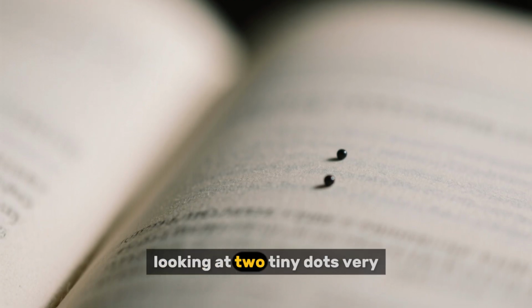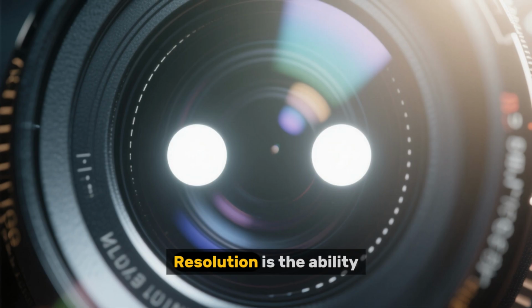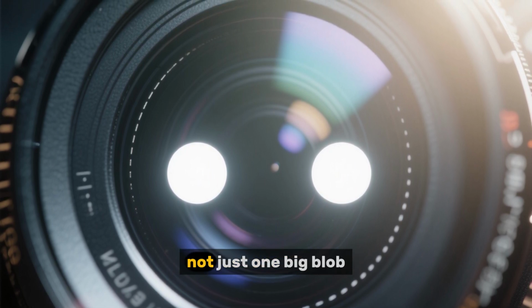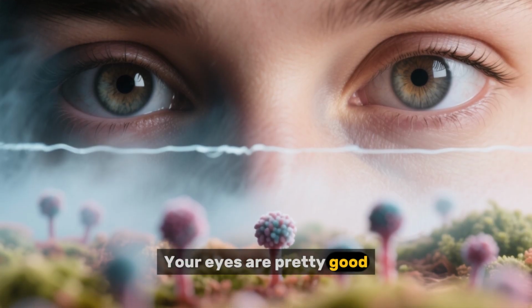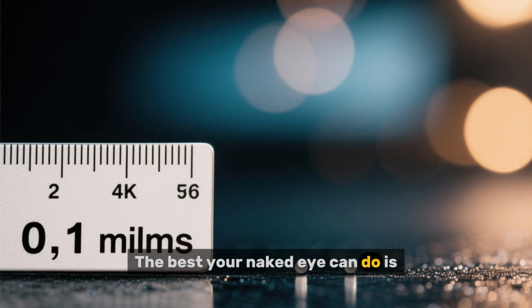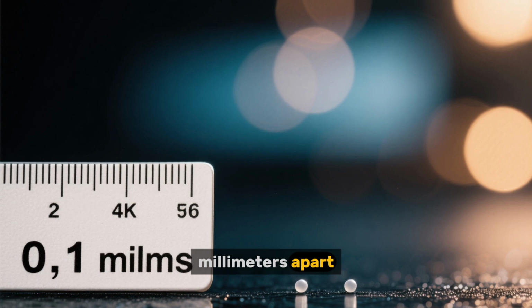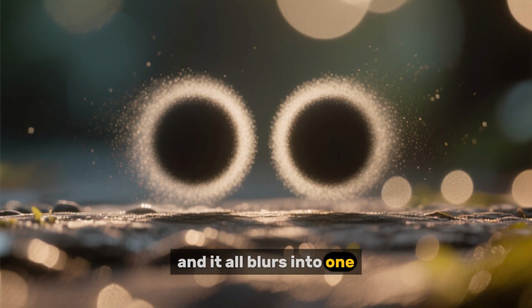Imagine you're looking at two tiny dots very, very close together. Resolution is the ability of a lens to tell you that there are actually two separate dots, not just one big blob. Your eyes are pretty good, but they have their limits. The best your naked eye can do is resolve two points that are about 0.1 millimeters apart. Anything closer than that, and it all blurs into one.